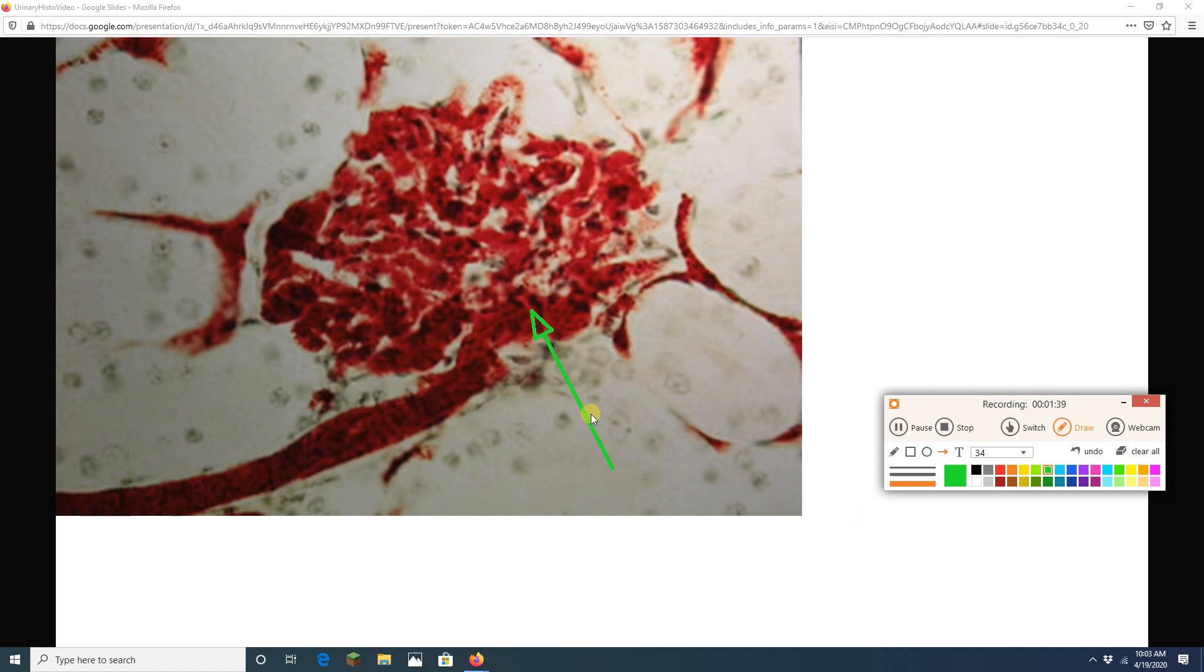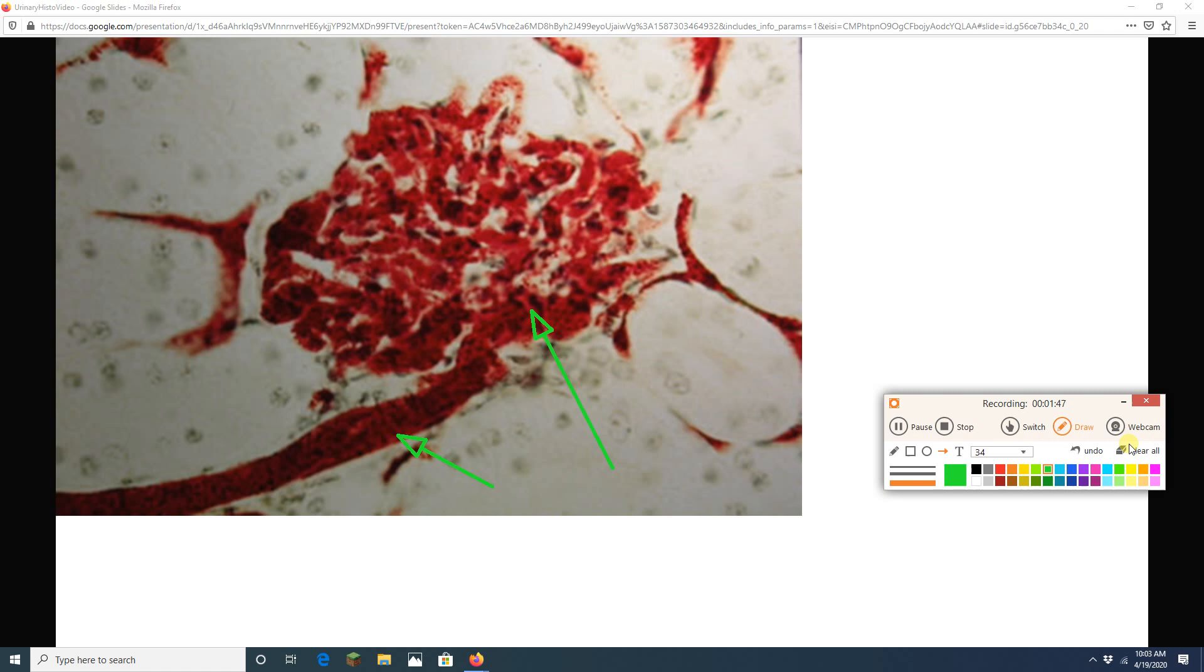Got another glomerulus here. Look at it. Beautiful. And I see its afferent arteriole right there. There we go. Now we're technically done with that one.